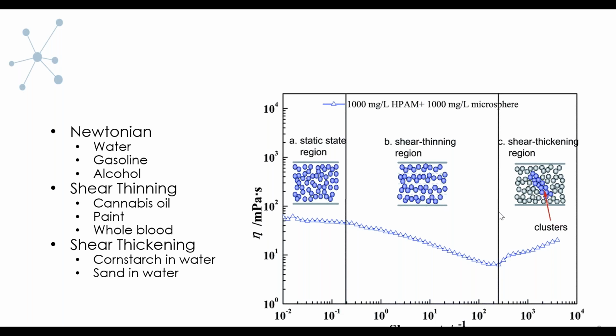However, with shear thickening, you have cluster formation. You may have some areas that are lined up, but then the molecular interaction between the molecules can cause a cluster, which you can think of as kind of like a roadblock. This prevents the different molecules from sliding over each other, and that is reflected as shear thickening.